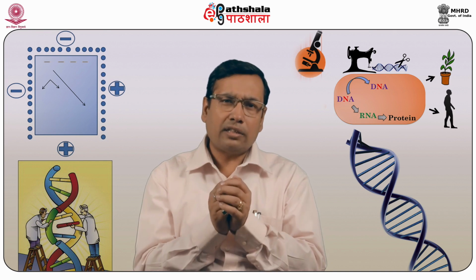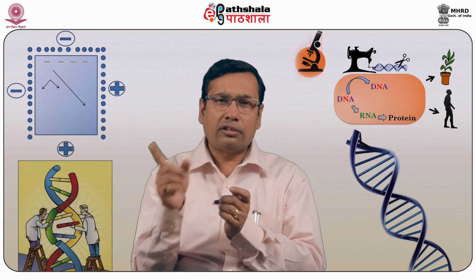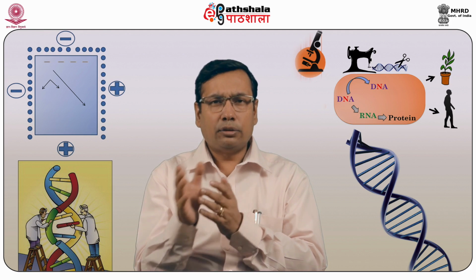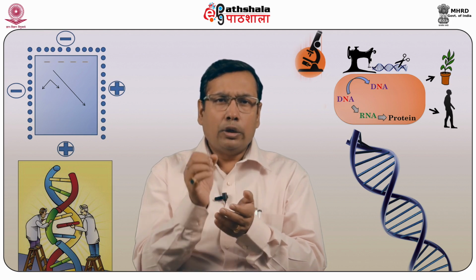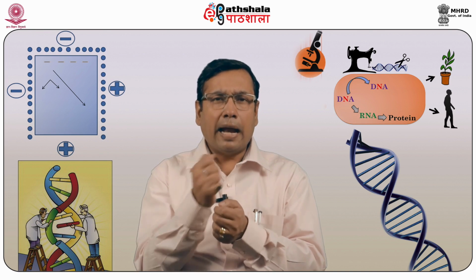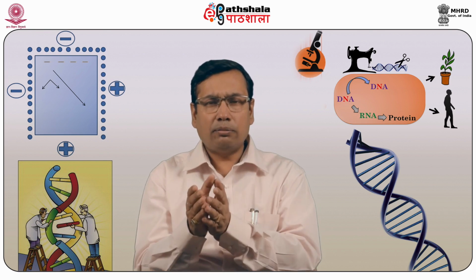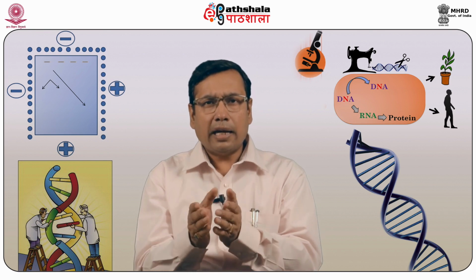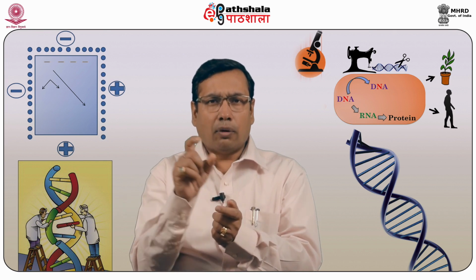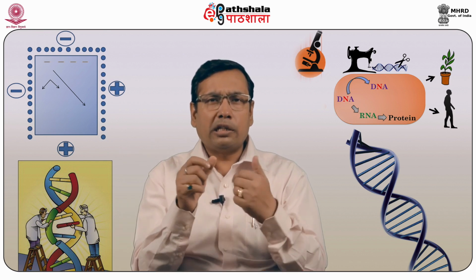What is happening in the hot start PCR is that upon completion of the first denaturation cycle, that is after 4 to 5 minutes in case of plasmid DNA, or 7 to 10 minutes in case of genomic DNA, you stop the reaction for a minimum period of time and add the Taq polymerase, because after the first cycle, from the second cycle till the penultimate cycle, a brief denaturation is followed by annealing and elongation, and there the Taq polymerase will immediately start working.